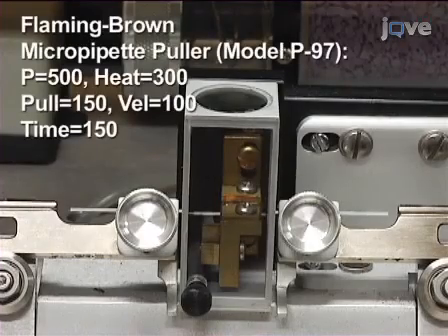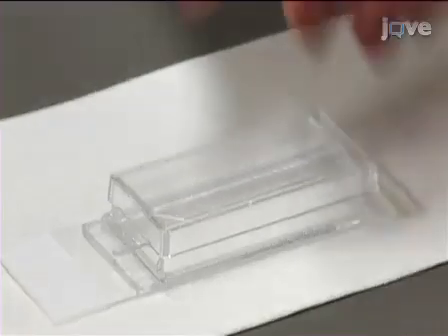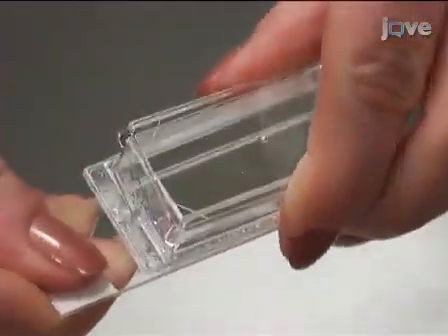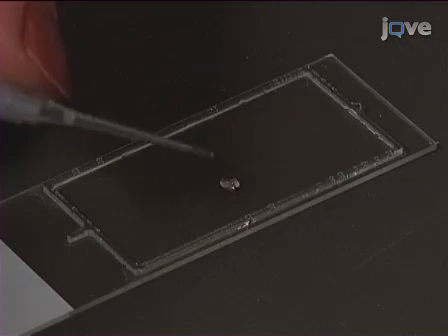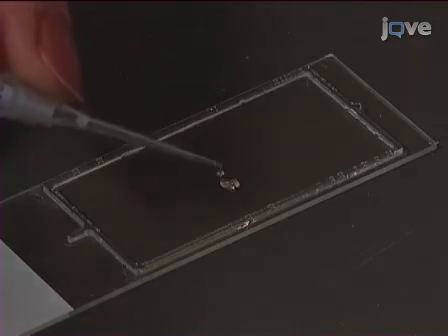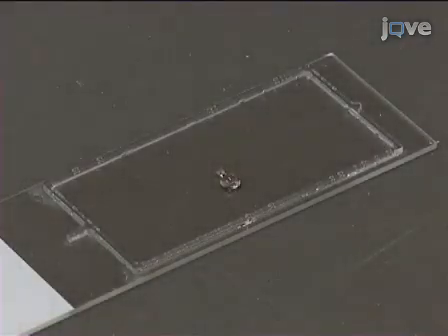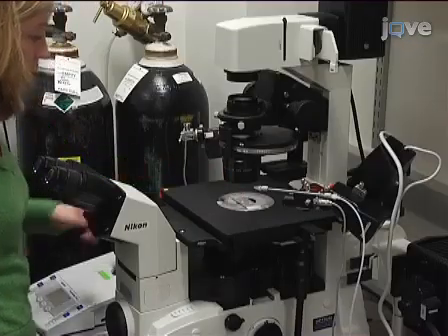Make injection pipettes by pulling borosilicate glass capillary tubing in a mechanical puller. Remove the media chamber from a 1-well chamber slide. To create a microinjection platform, place a 5 microliter drop of collection medium as close as possible to a 0.5 microliter drop of siRNA, cRNA, or morpholino oligonucleotide injection material. Cover with mineral oil and place on the microscope stage.